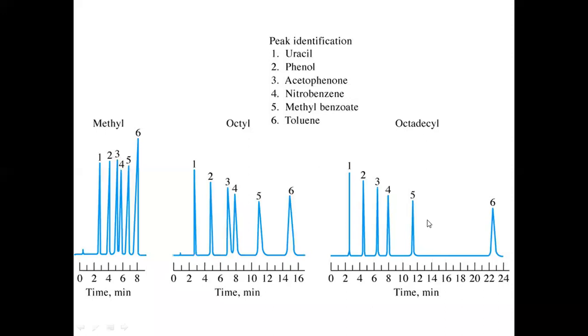And this can be explained by looking at the chromatograms obtained. There is not even 1% of overlapping seen between the two neighboring peaks. If you look at peaks 1, 2, 3, 4, 5, 6, etc., if you look at the neighboring peaks, there is no overlapping at all.